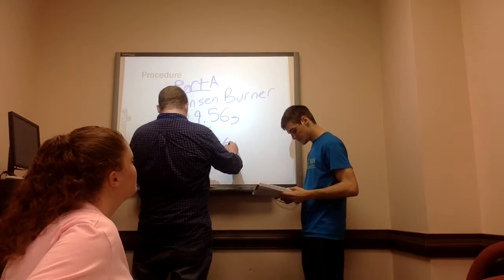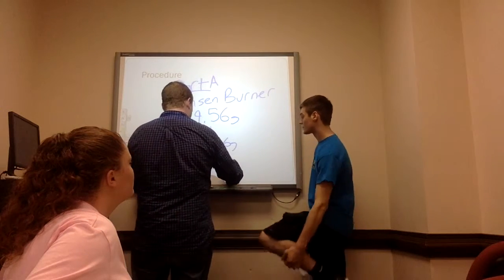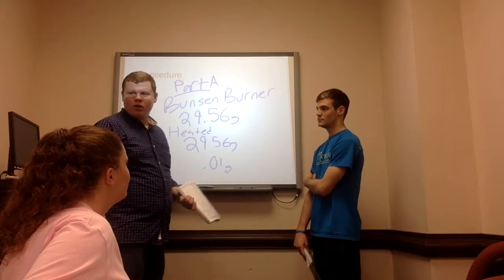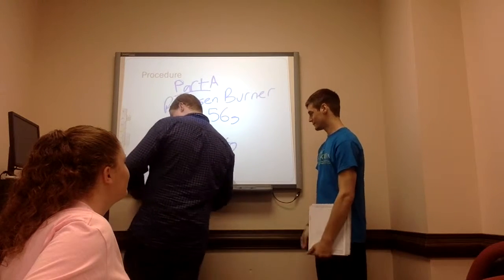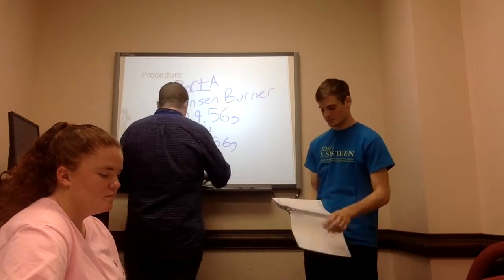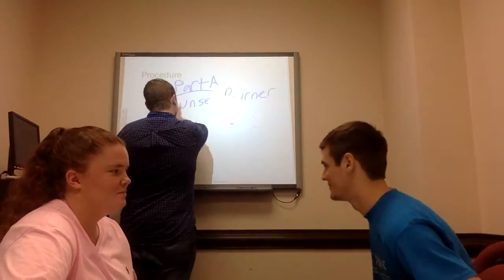So because of that, you were finished because you were within 0.01 grams. Correct. Okay, Miss Jackson, you were also within 0.01 grams. Timmy, were you within 0.01 grams? You were. So that is the gist of part A of the procedure.